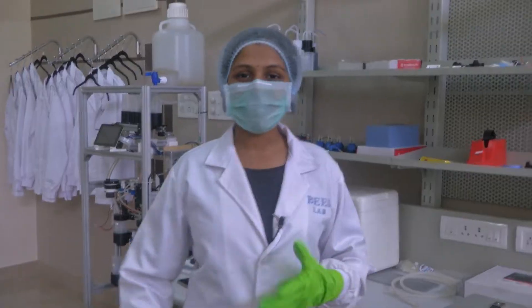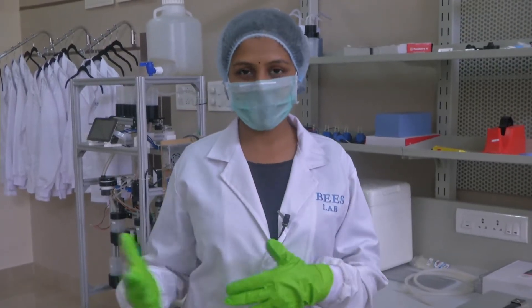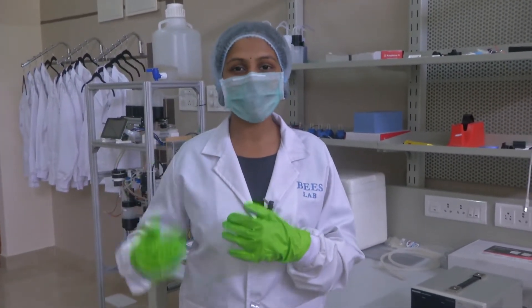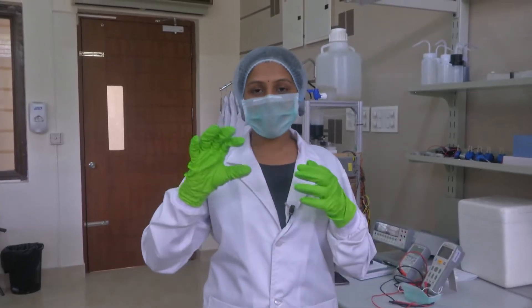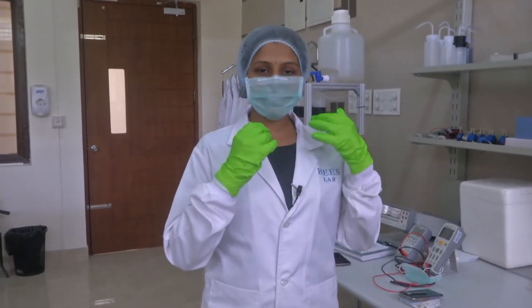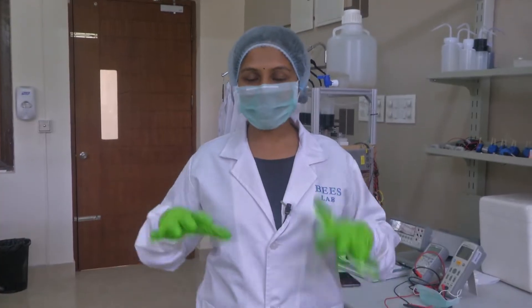Hello all, welcome to the next module in our course Sensors and Actuators. Today let us see the different equipments which can be used while working or when we want to study how to fabricate devices and how to characterize them. So here we have two sections in this laboratory: one is the characterization section with multiple workstations, and the other is the biology section, again with workstations and different equipments. During this short video I am just going to brief you about the various workstations and equipments present here. To begin with, we have workstation 1 here in the characterization facility.